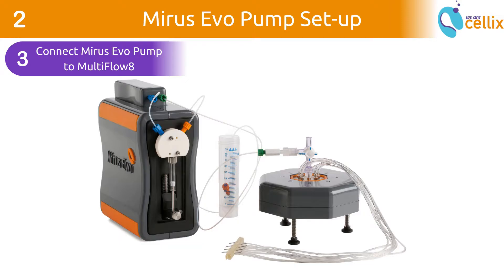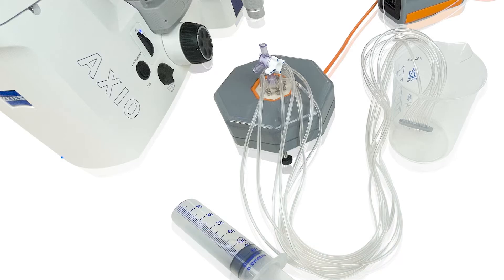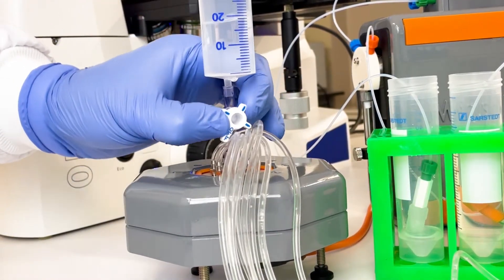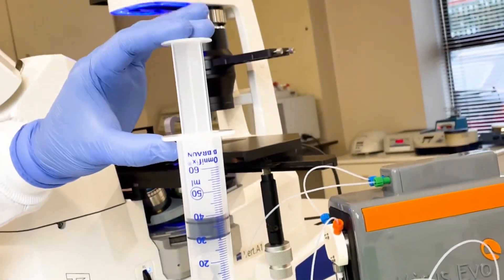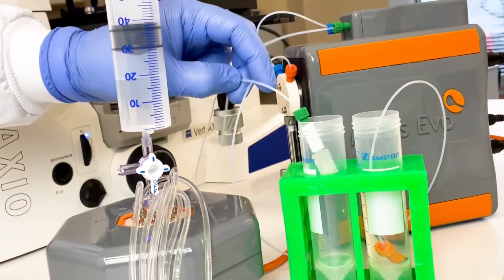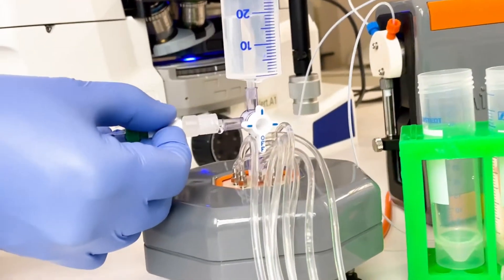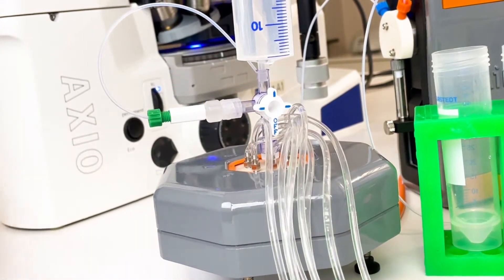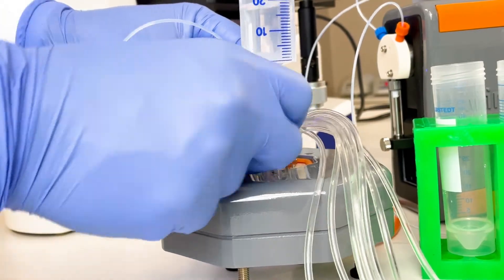The next step is to connect the MyReceivo pump to the Multiflow 8. To do this, we must prime or wash out the connector. Turn the valve 90 degrees anti-clockwise or downwards towards the Multiflow 8. Gently tap the top of the plunger — this releases a small amount of liquid which you will see coming out of the connector. Take the outlet of the pump and connect it to the inlet of the Multiflow 8. Now turn the valve 180 degrees so that the off position is facing upwards towards the syringe. The 50 ml syringe may now be removed.